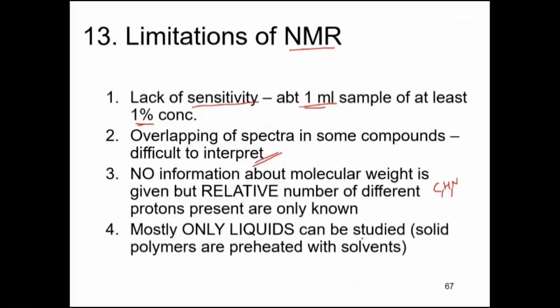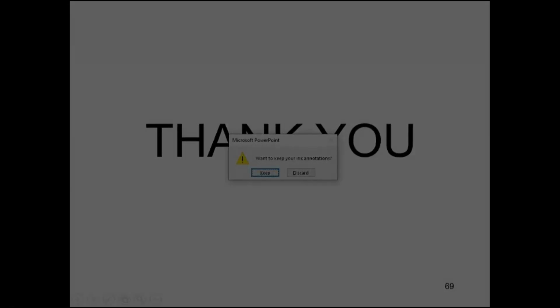Mostly only liquids can be studied. Solid polymers are preheated with solvents. So that's it. C13 NMR we'll see in the next lecture.